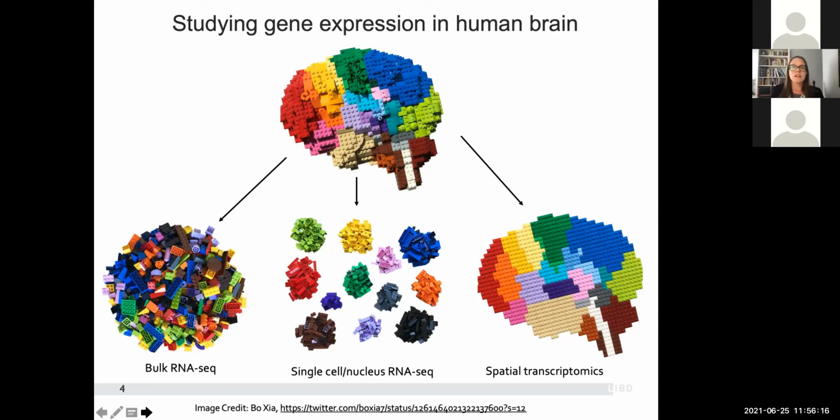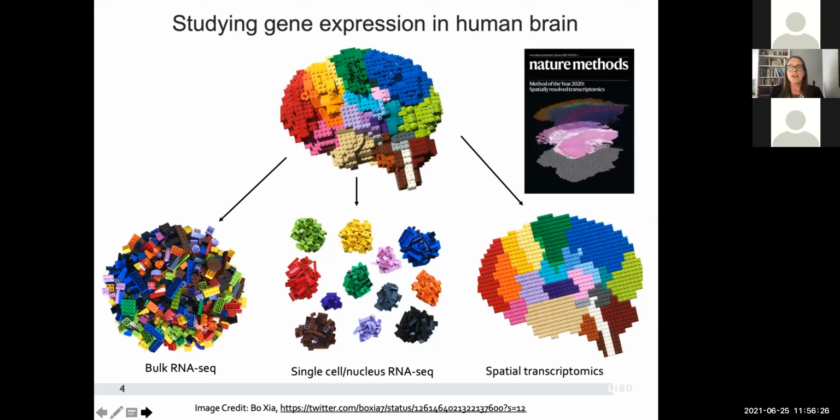And then most recently to spatial transcriptomics, which aims to link gene expression to its anatomical location to add molecular insights into structure-function relationships. In fact, spatially resolved transcriptomics is a rapidly evolving field that was just named Method of the Year by Nature Methods for its power to unlock relationships between gene expression and the spatial organization of complex tissues.